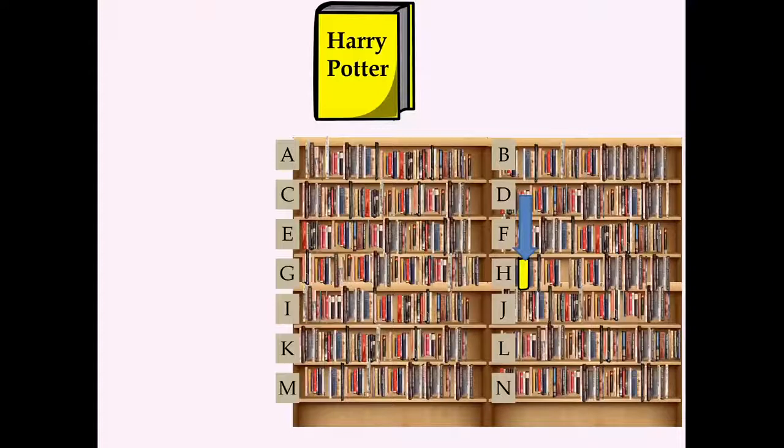Things like the size of the book, what the book cover looks like, things like the author. And this is basically the way we want to treat the DIA data: we want to start with things like we happen to know the retention time of this peptide. We know which peptides are stable. We know which product ions, what are the relative fragment ion intensities. So we know a lot about the information of an individual peptide. We know basically where to go in the library to look it up to begin with.